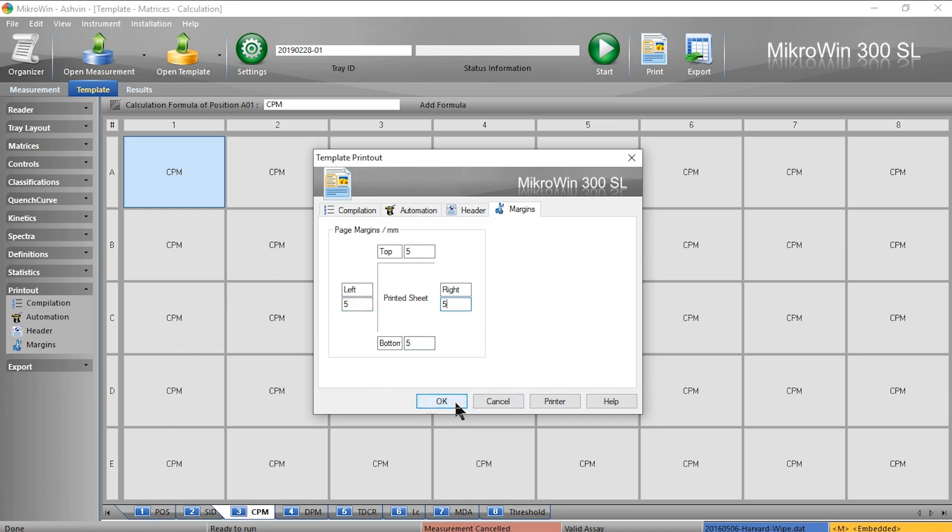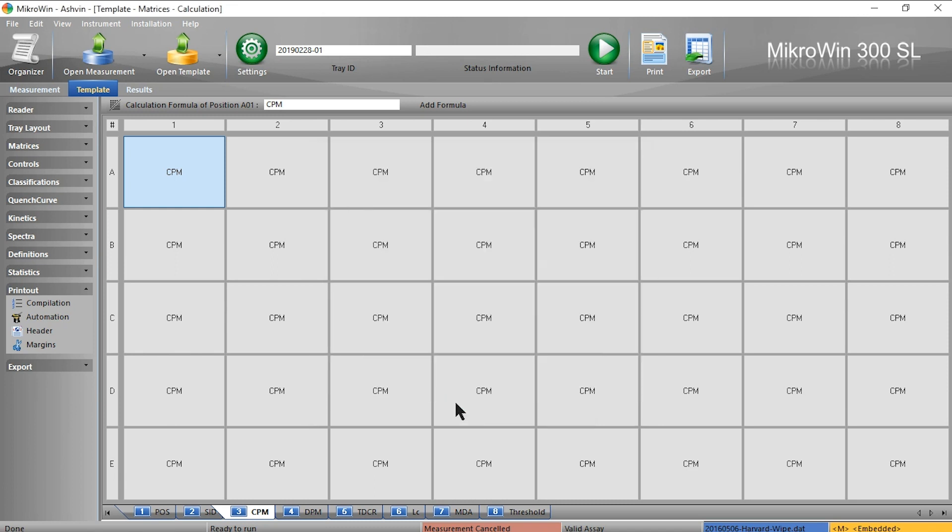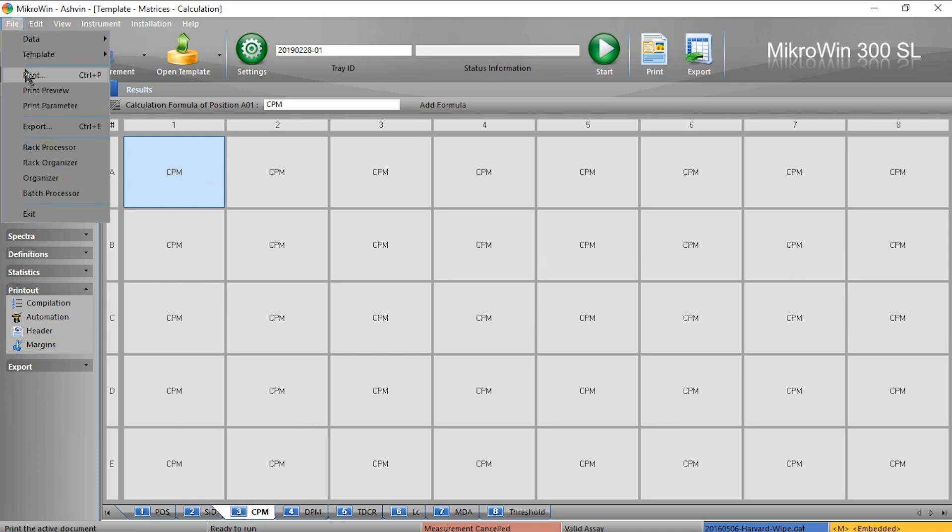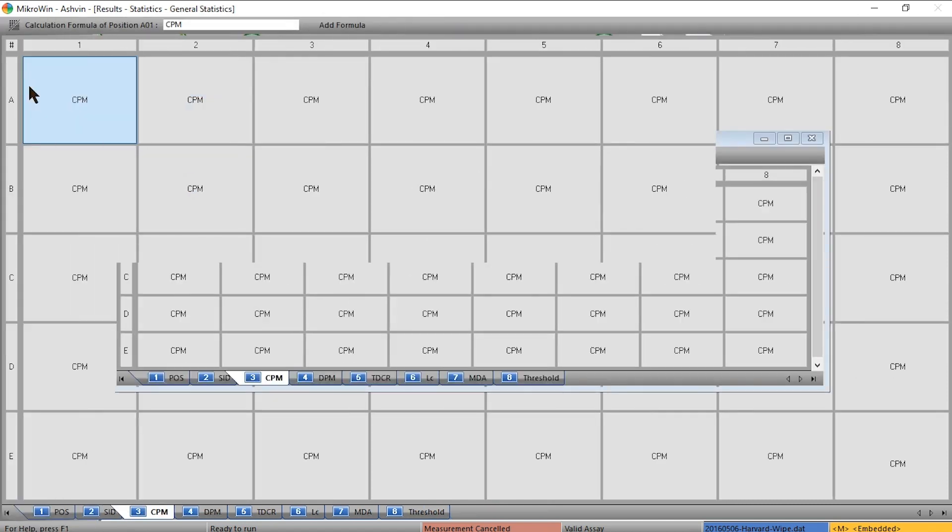Before I save or print, I can preview what we've done by going to file print preview.